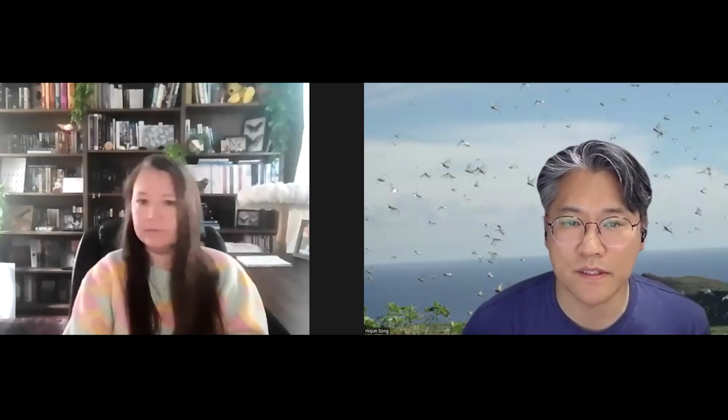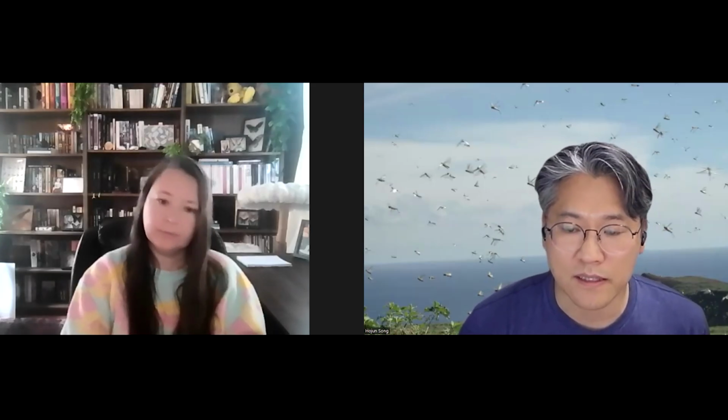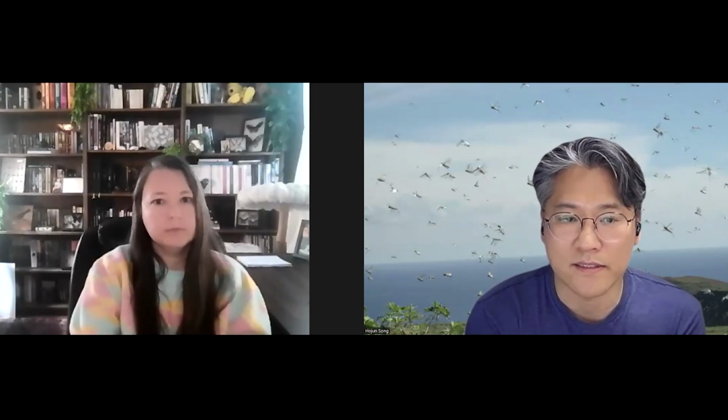I am the PI of the NEON Biorepository. The NEON Biorepository is a long-term, 30-year community resource optimized for monitoring and forecasting ecological responses to environmental changes at a continental scale. It's a physical infrastructure associated with NEON, and our core responsibility is to receive samples from the field sites and accession, curate, and voucher those samples. And then we strive for long-term preservation, and we respond to external research communities through loans and data accessibility.